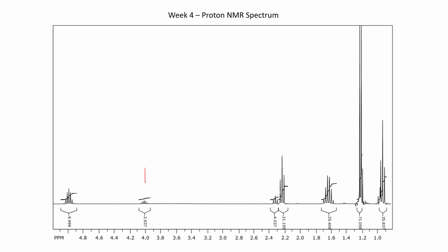What's going on is this is unreacted isopropyl alcohol. So the distillation process that occurred in this experiment did not remove all of the isopropyl alcohol.